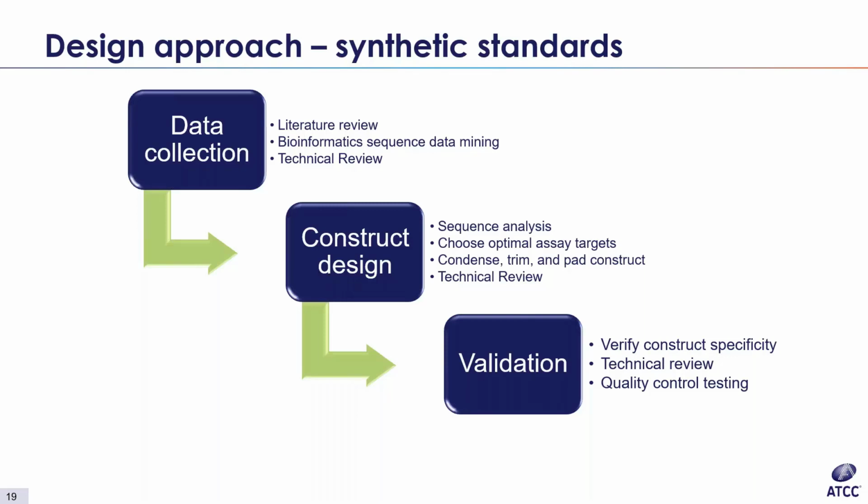Following completion of the design, we have a regulatory review to make sure we don't make anything that could be used nefariously. And then the construct is actually produced. Assays are double checked and optimized, and last, vials are filled and tested.